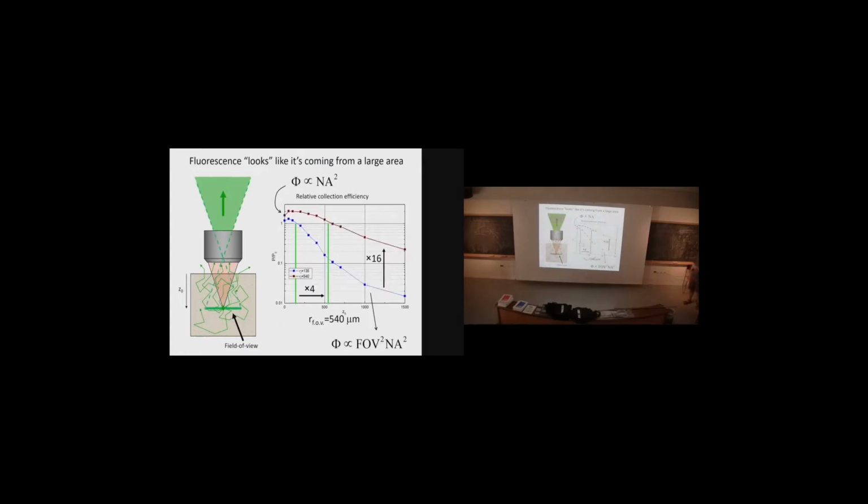And for example, typically the field of view of a microscope is defined by some kind of field stop. If you get inside your microscope, take a drill and blow out the field stop, you can maybe expand your field of view by, let's say, maybe a factor 4. That gives you a factor of 16 increase in collection efficiency. Right? So if you increase your collection efficiency by a factor of 16, that's equivalent to multiplying your laser power by a factor of 4. It's a lot easier to take a drill, blow out the field stop, than buy a laser that's 4 times more powerful.